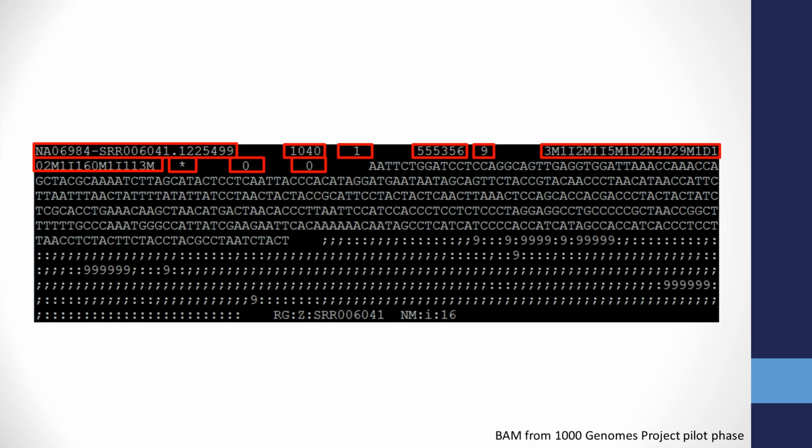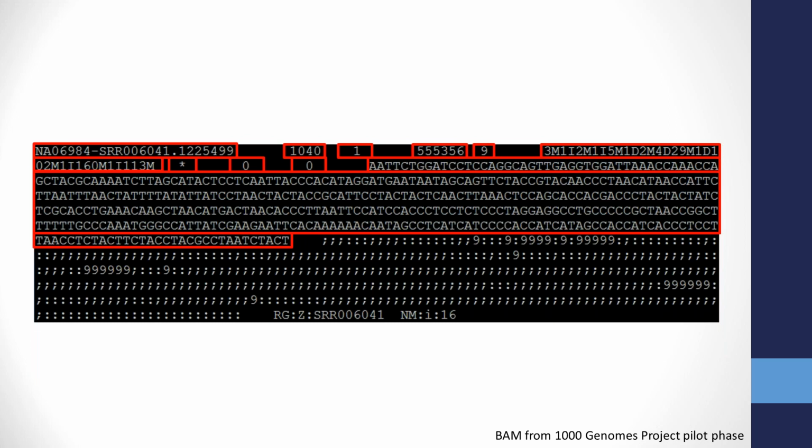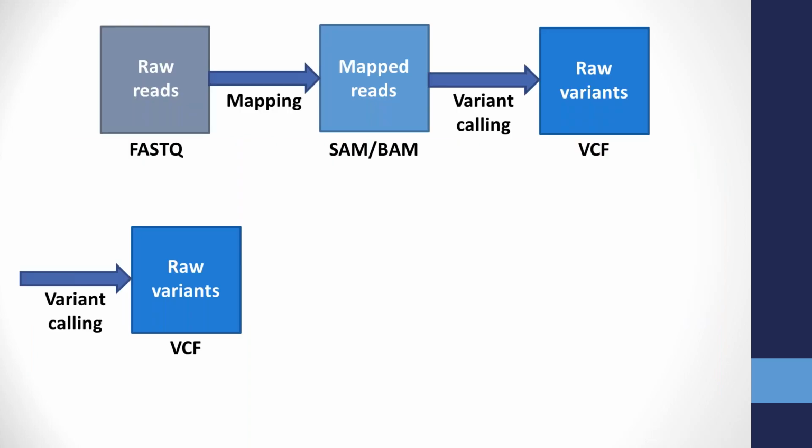These next three have to deal with the next reads and template length and that sort of stuff, which aren't included in this particular BAM from 1,000 genomes. Then we've got our nucleotide sequence, and then here's that representation of our quality scores. And then at the end of the file, we might notice there's some additional fields that have been appended, some information about the sample read group and that sort of stuff. So there can be quite a few of these depending on what you're actually using.